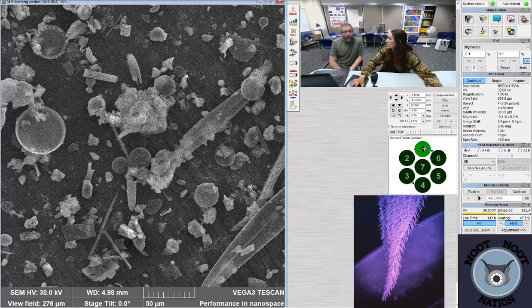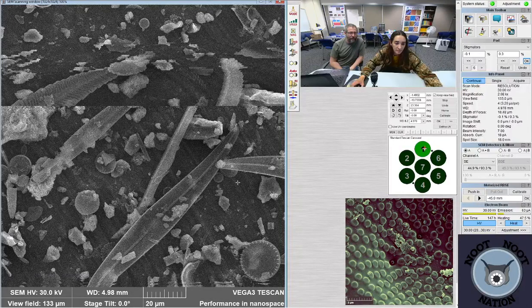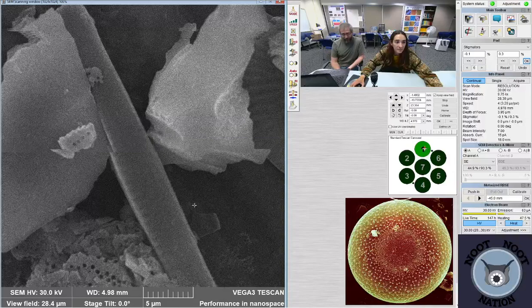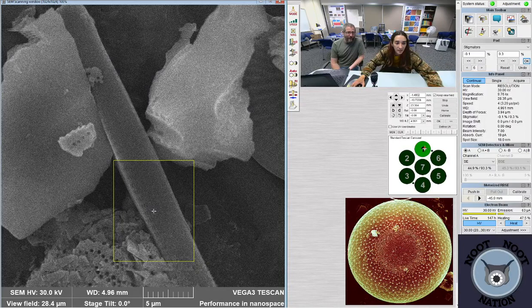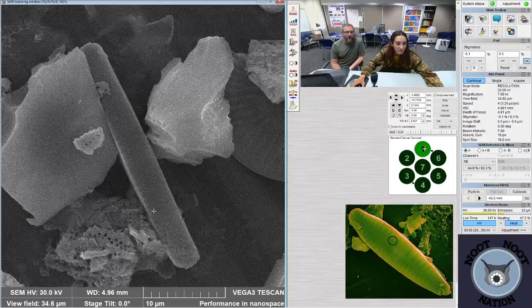This one's the oblonga one? Yes, that's Navicula oblonga. So which university do I work at? I work at Indiana State University. That's the lab that we're in right now, where my SEM is located and most of my light microscopes are located. And Laura is my master's student in my lab, and so is Addie. Addie's in the lab right now counting. That's why she's not here visiting with us. That's a side view of a Navicula. But she's here for the summer as well, and so we'll probably see some of Addie.